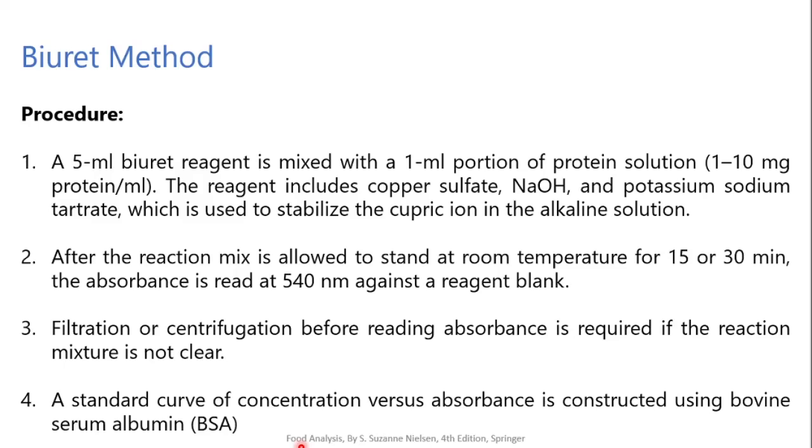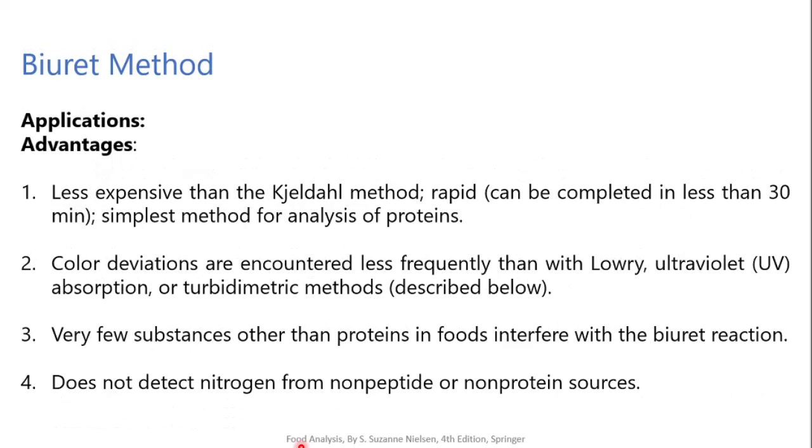protein samples. Then what are the applications? The biuret method has been used to determine the proteins in cereal, meat, soybean proteins and for quantitative tests for various kinds of animal feeds. The biuret method is also used to measure the protein content of isolated proteins.